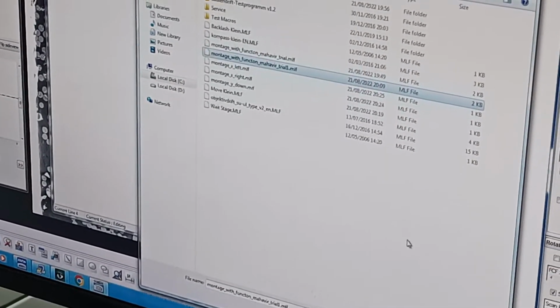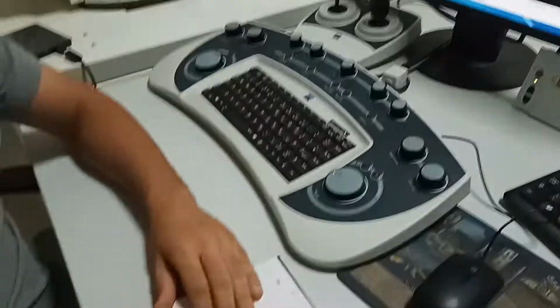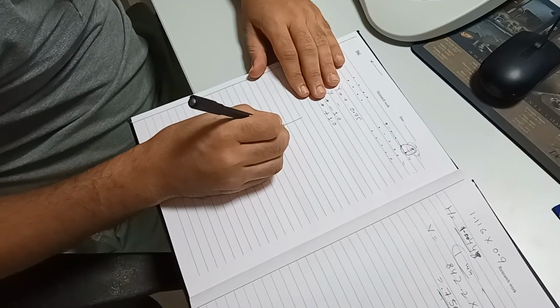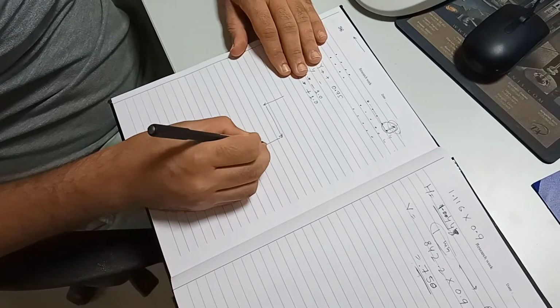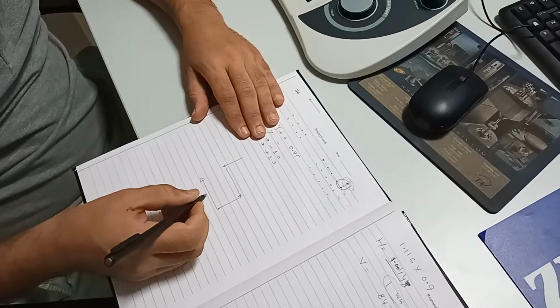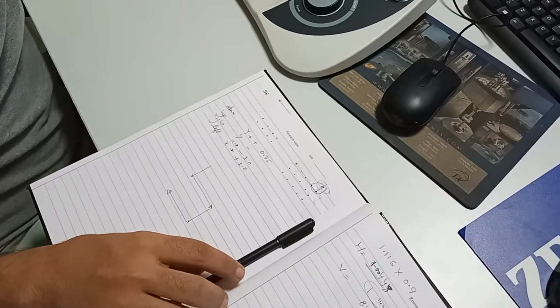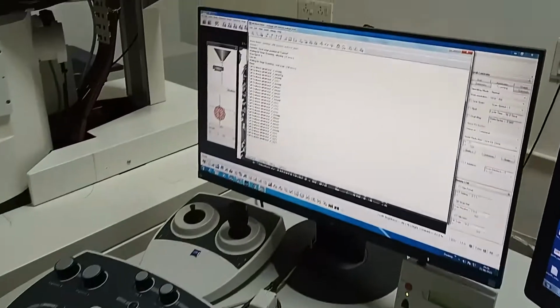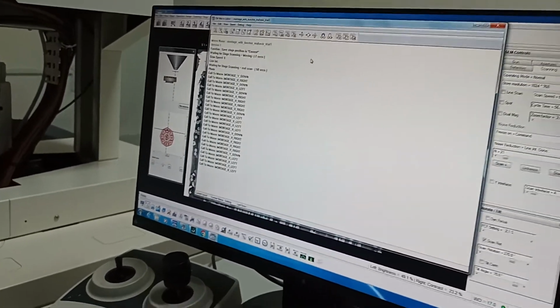I call this method once again. You remember that the first step is down, right, down, left. It means that it should move like this, down, and for us right is this one. So it should go down, and again it should come down, and then it should come to left. So this is something we want. This is our trial. We will check it. So what I will do, I will simply run it. Now let's make another segment.